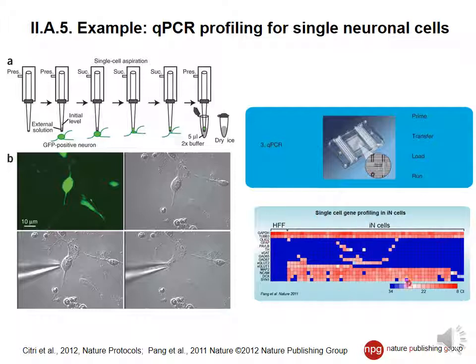And this is the data analysis shown in the paper, and on the side you can find some of the genes that they tested in this array. At the top there are some of the housekeeping genes used, GAPDH and tubulin, which is another cytoskeleton gene. And every column in this diagram represents a single neuronal cell and the profiling of all these genes.